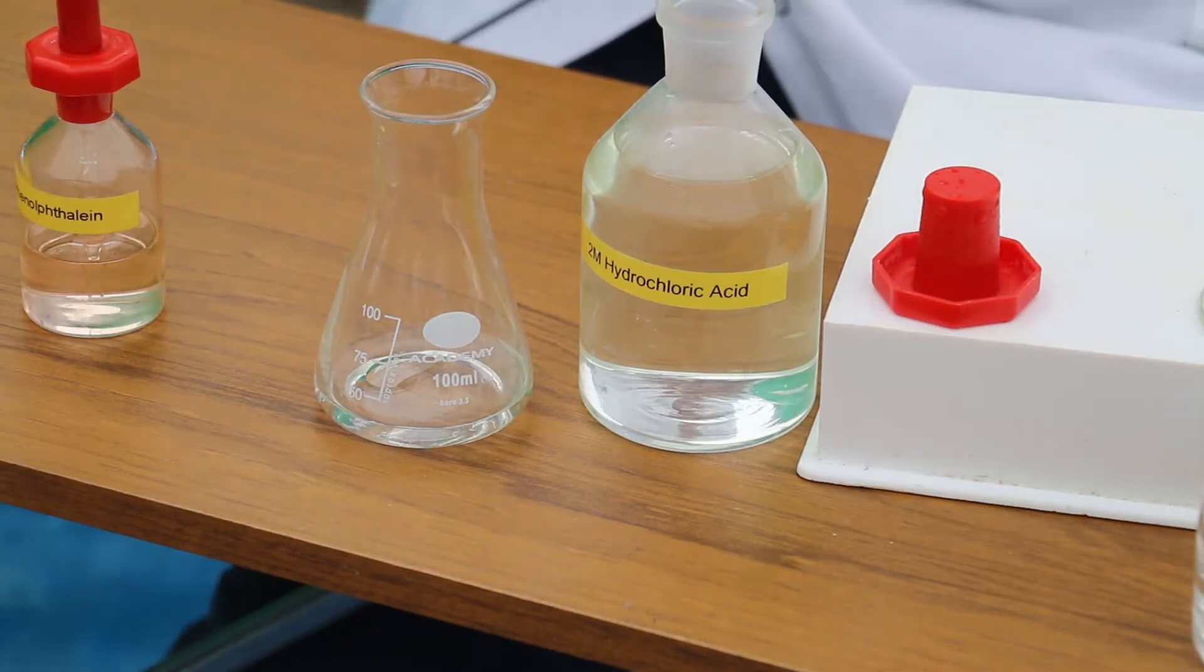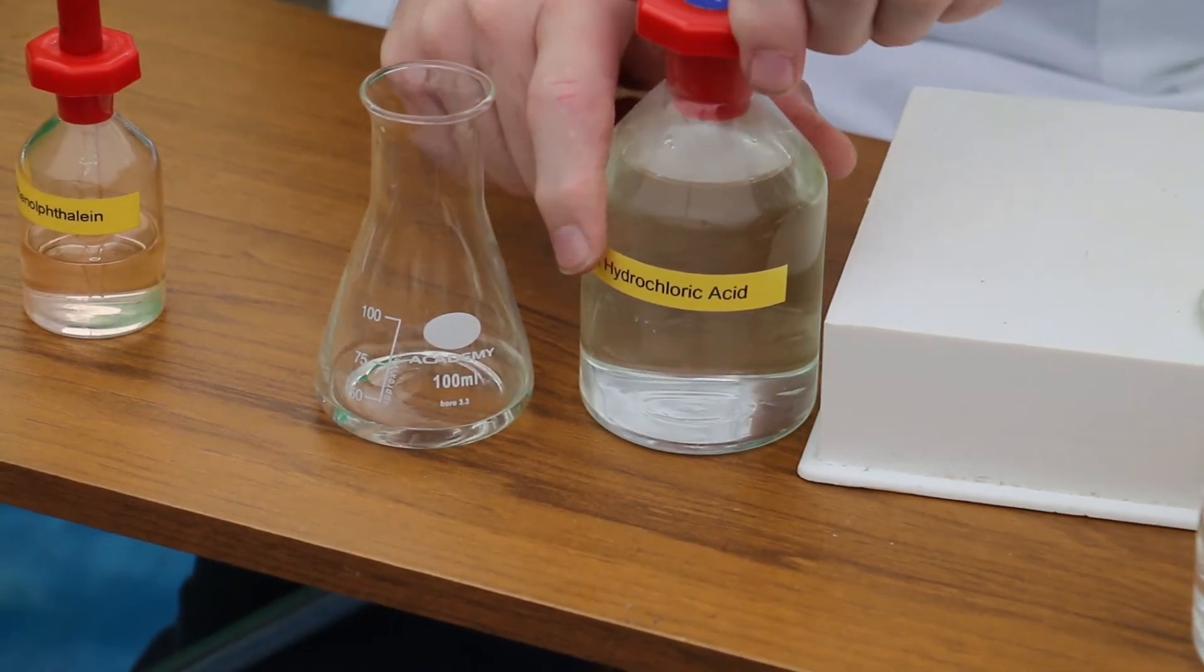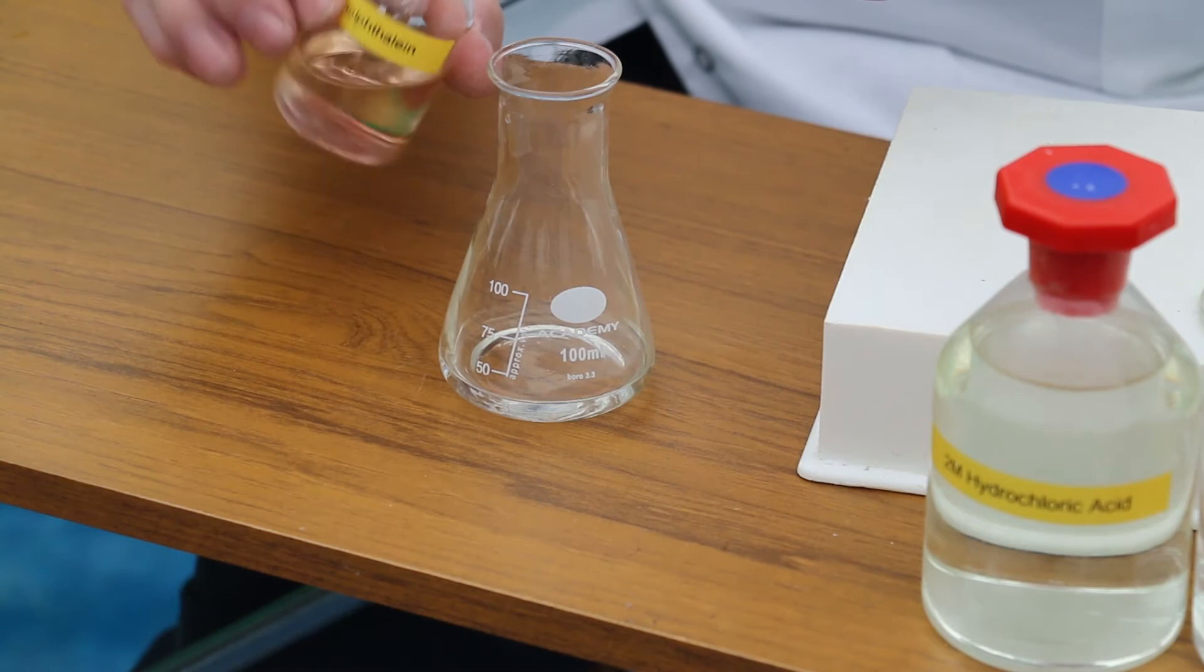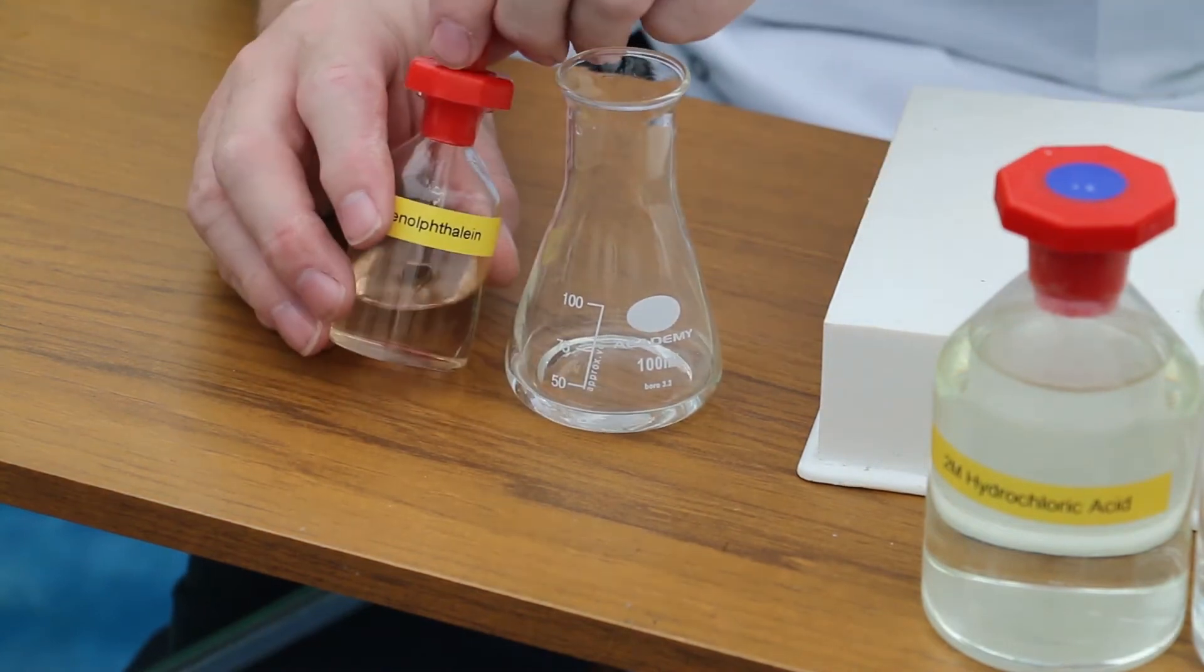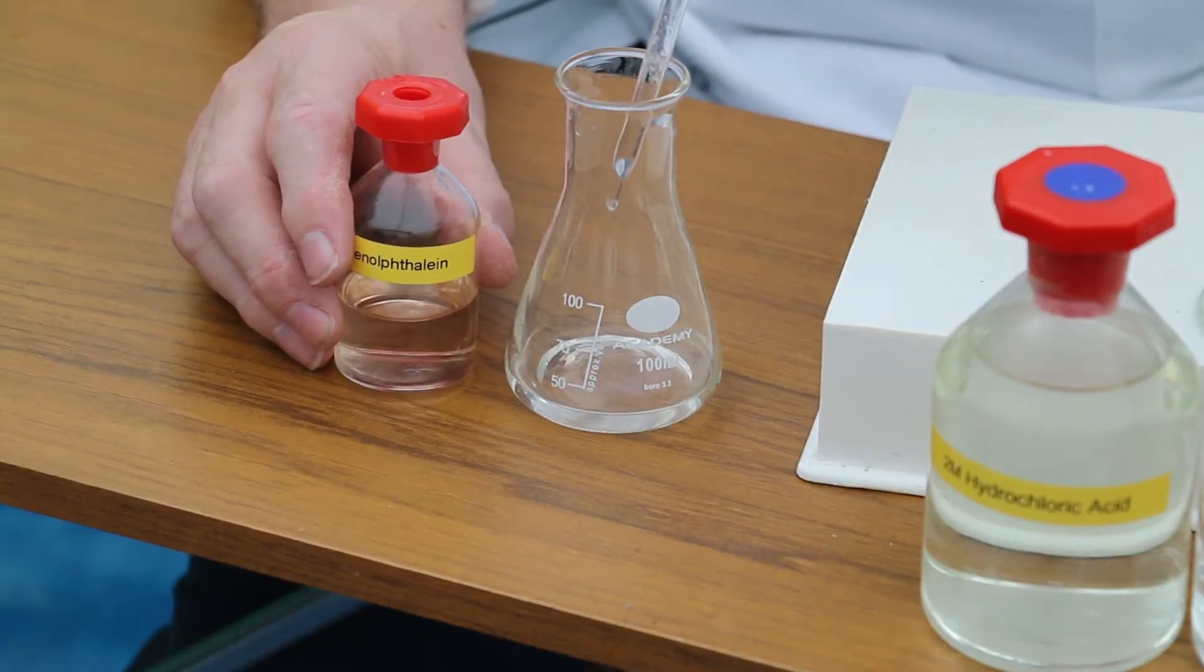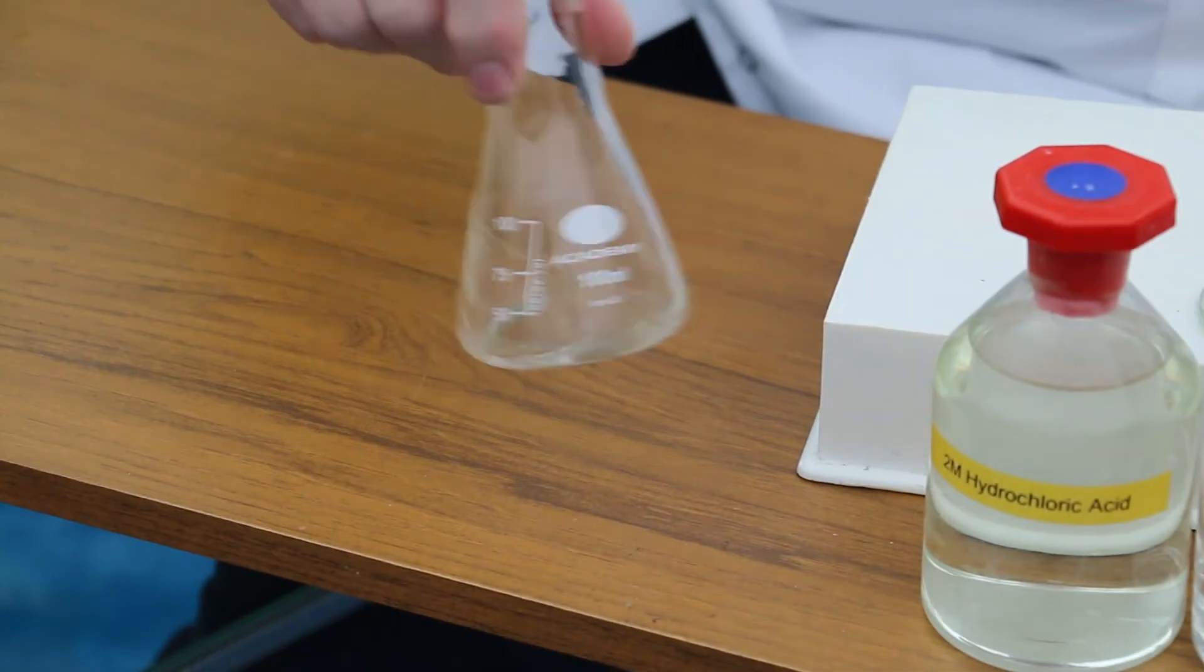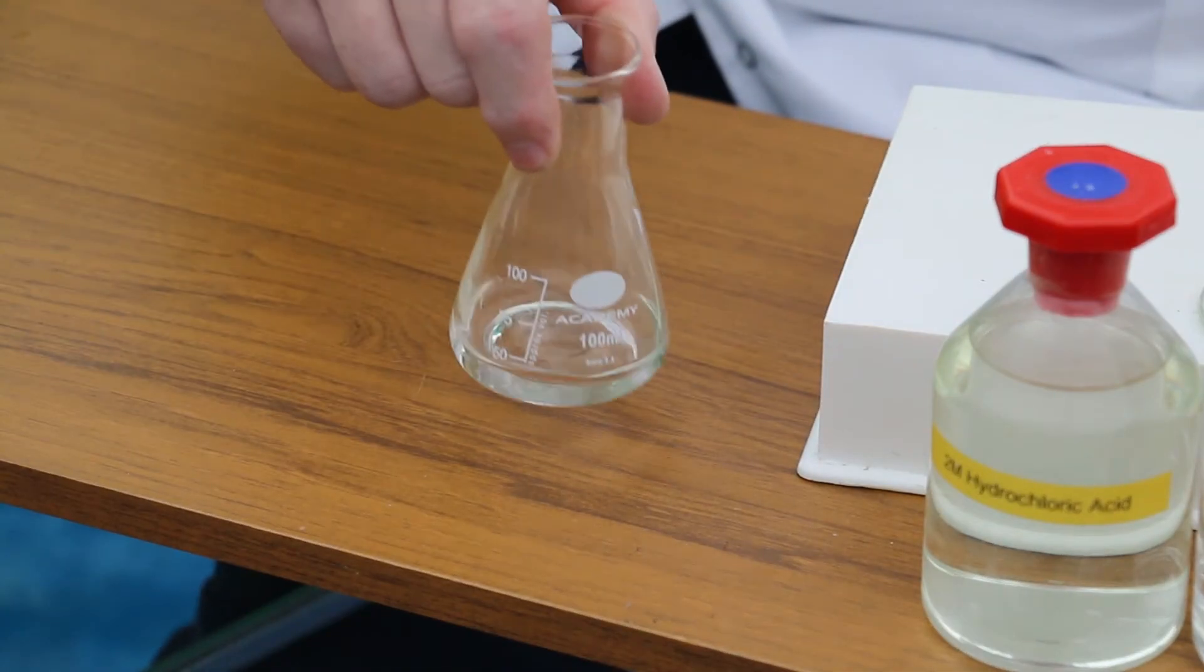Now that we've got that done I'll replace the lid on the hydrochloric acid. Our next job is to add two or three drops of this indicator, phenolphthalein, to our acid. We only need a few drops because this is very strong. I'm going to swirl the conical flask to make sure it's thoroughly mixed.